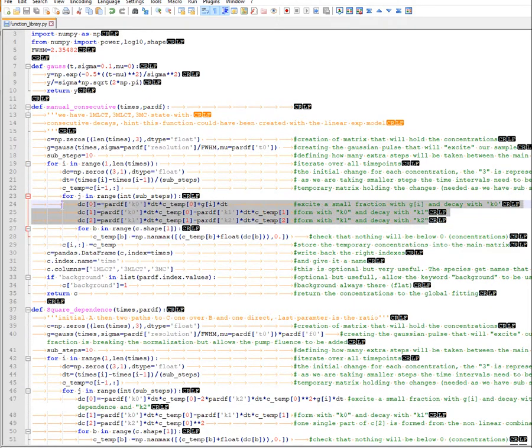For defining the kinetics or the time development, I commonly use differential equations, where we generate a pulse or a sample, a pulse. This can of course be also a measured pulse, doesn't matter. And then I write a differential equation, which is the decay of the function. You can write any function you want. You can use any input data. I have successfully, for example, used data from a potentiostat for describing spectroelectrode chemistry data.